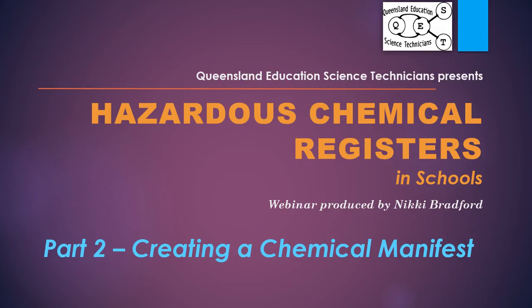Welcome to Part 2 of the Queensland Education Science Technician webinar on hazardous chemical registers in schools. In this presentation, I will walk you through creating a chemical manifest using Microsoft Excel 2013. The tools I'll be using are also available in the 2010 version of Excel, but they may be located in a different toolbar ribbon. If you are having trouble locating a tool in your version of Excel, use the Help function to search for its location. I will show you how to do this shortly.